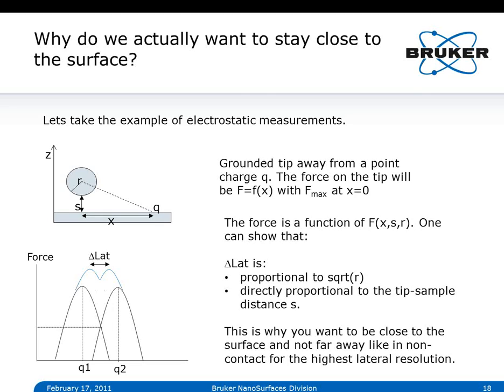separate these two charges. We can show that the lateral resolution is proportional to the square root of the tip radius, but more importantly, it is directly proportional to the tip sample distance S. So the tip sample distance is actually more important than the size of the AFM tip that we're using. And that, in a very simple way of looking at it, is the reason why you want to stay close to the surface and not far away like you do in non-contact mode for the highest lateral resolution, if that is your goal, which it is for most of us.